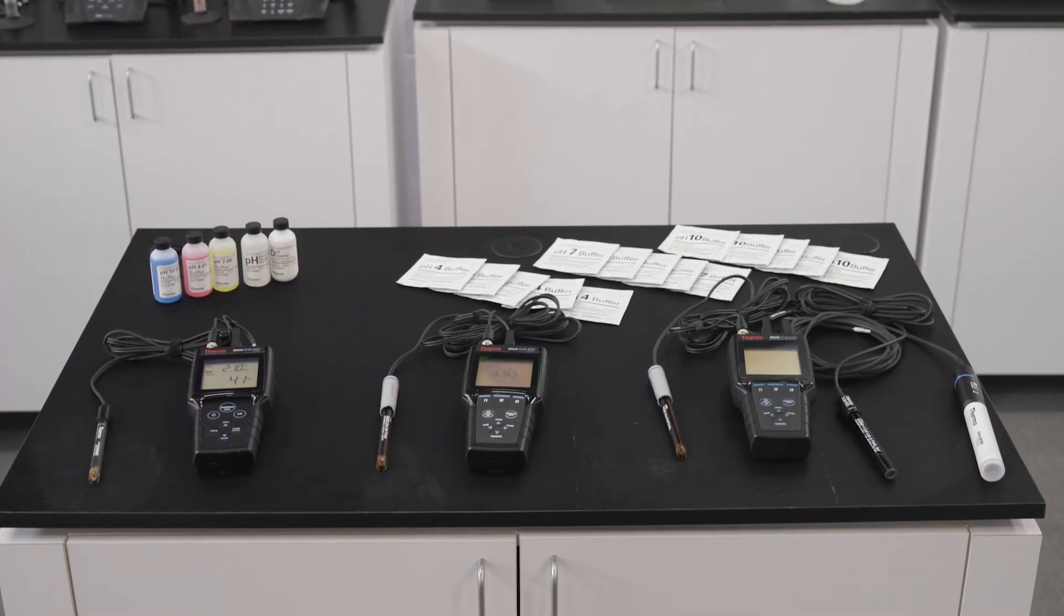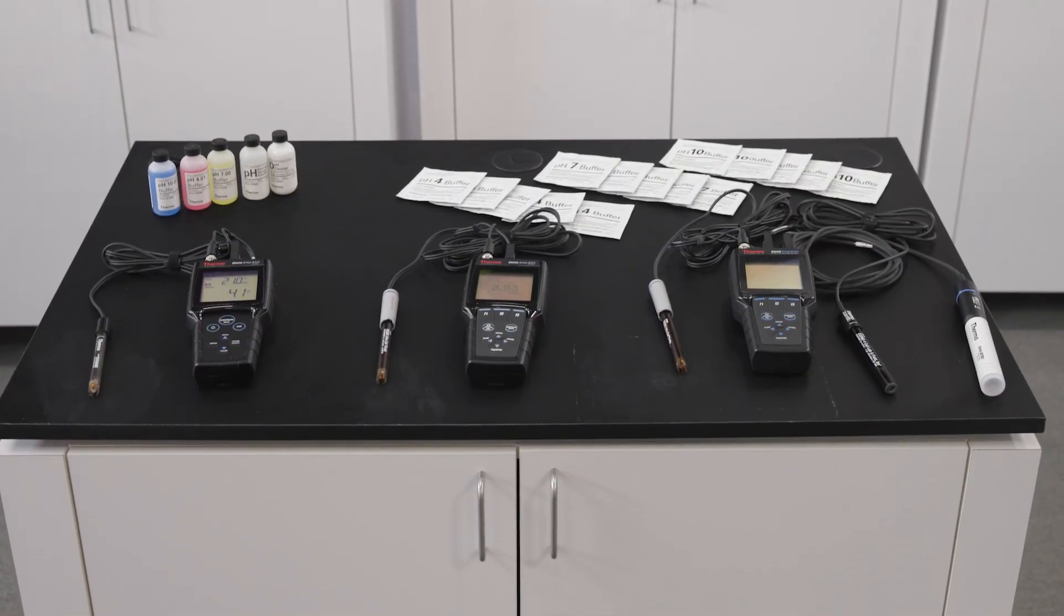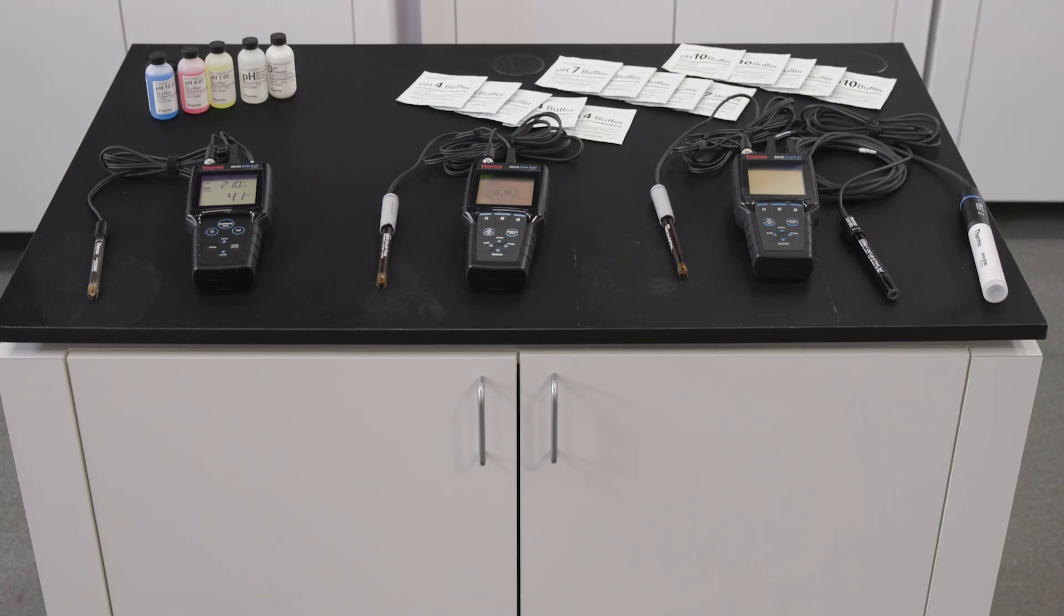In this video, we'll discuss what to evaluate when shopping for a new portable pH meter. You'll answer a series of discovery questions to help guide you in finding the right meter for your application.